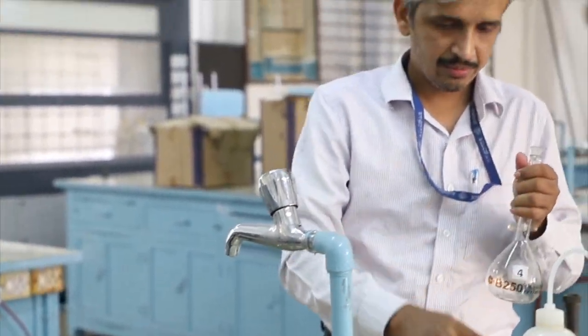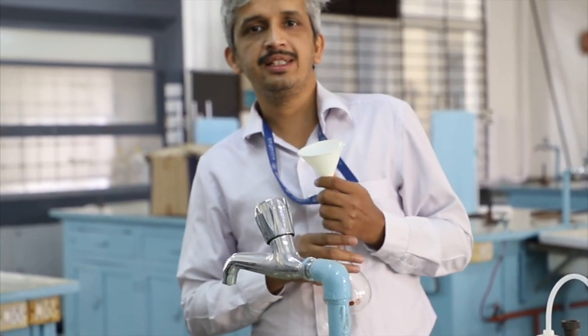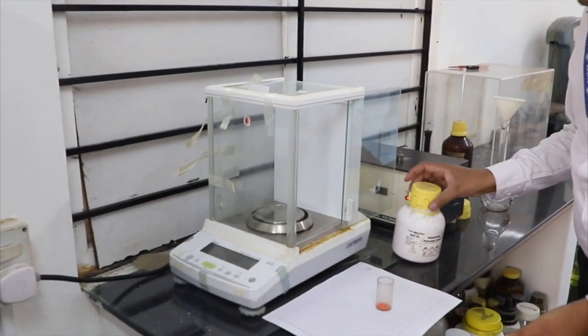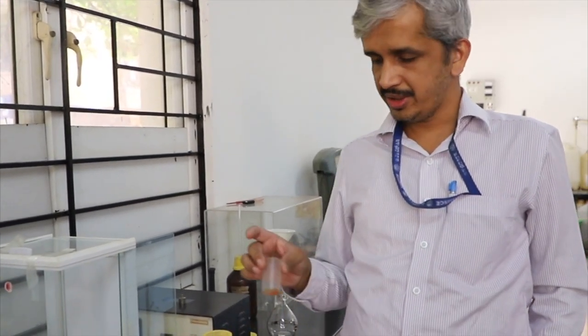So then after placing this funnel over the standard flask, one can go for weighing the corresponding salt for the given experiment. Today, for demonstration purpose, we are using potassium dichromate. The exact same procedure should be followed for any other solution preparation. So today we will have a solution of potassium dichromate. We will see how to make a standard solution of potassium dichromate.